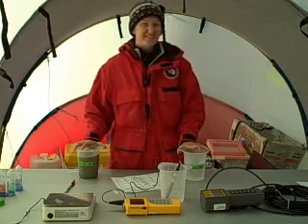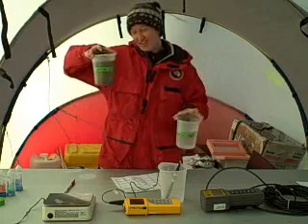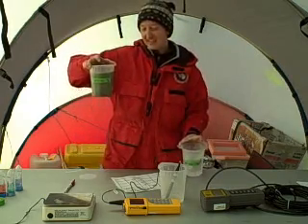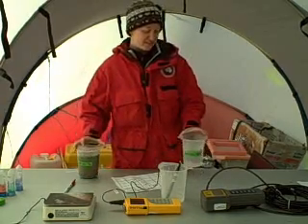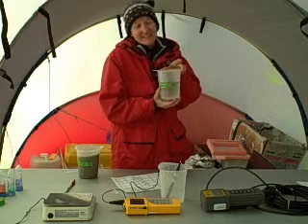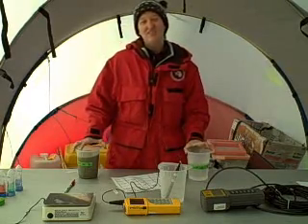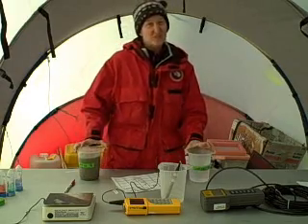Salt in a glacier. To do this, we have clean ice that we've melted and dirty ice that we have melted from the Taylor Glacier. Obviously you can see that the dirty ice has a lot of sediment mixed in with it, and the clean ice, it's clean. It doesn't have that much sediment. So what we're going to do today to see if there is salt in any of our ice samples is we're going to test two different things.